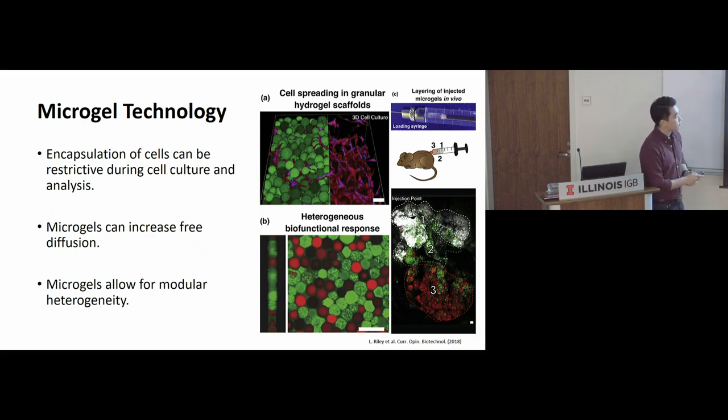And also with the microgel technology, you can start mixing different microgel types into one system. As you can see here, you can layer your microgels in a syringe, and then once you inject it, you have your three different layers of microgel type. So depending on your use, this is a very versatile tool, again.